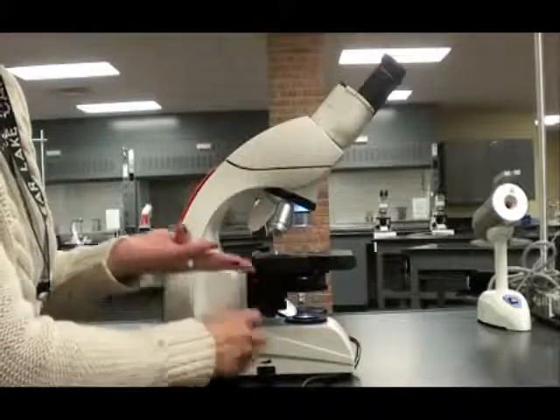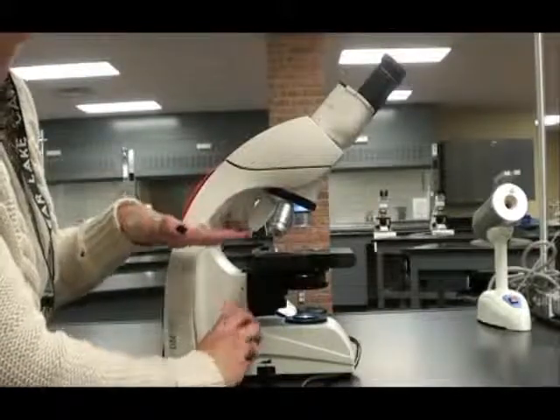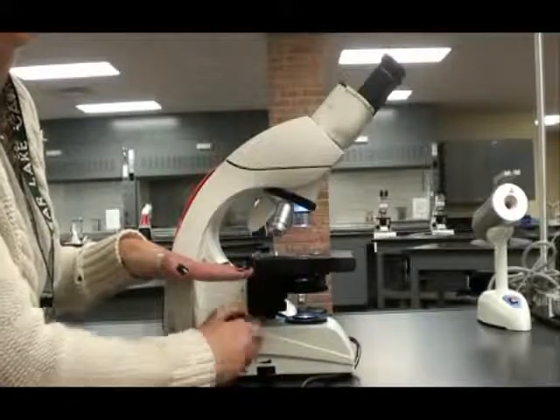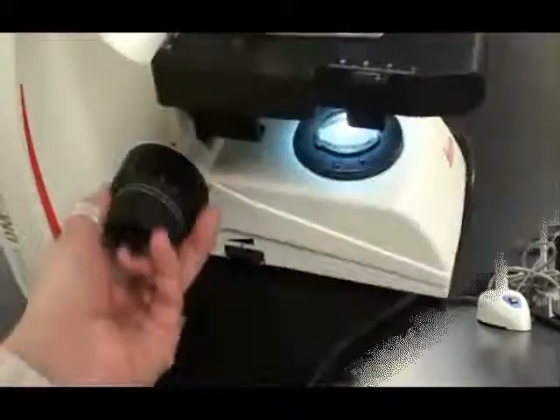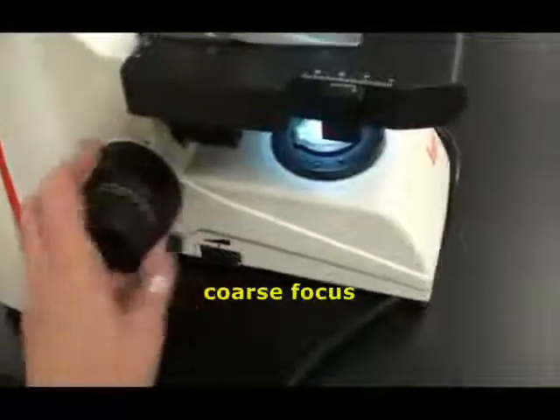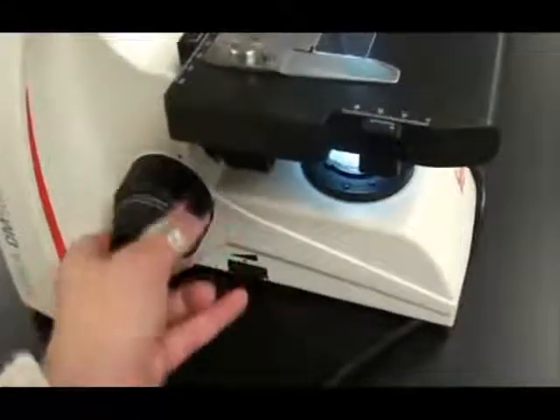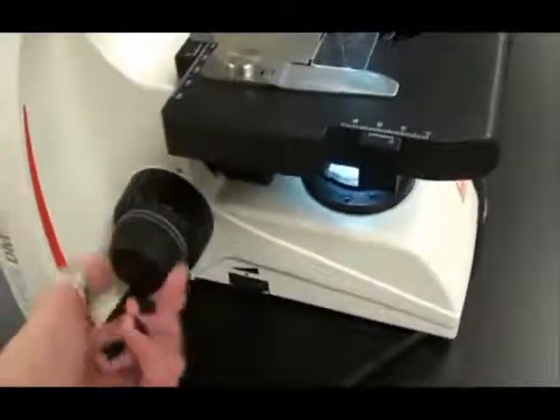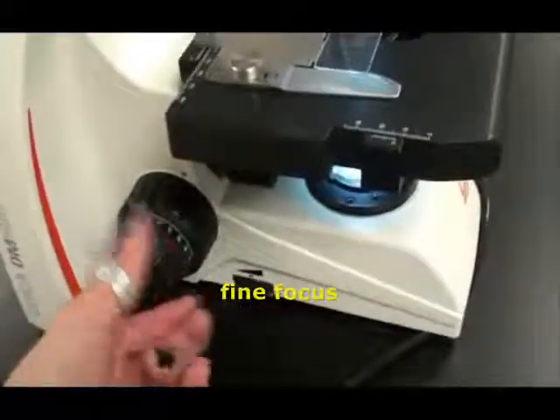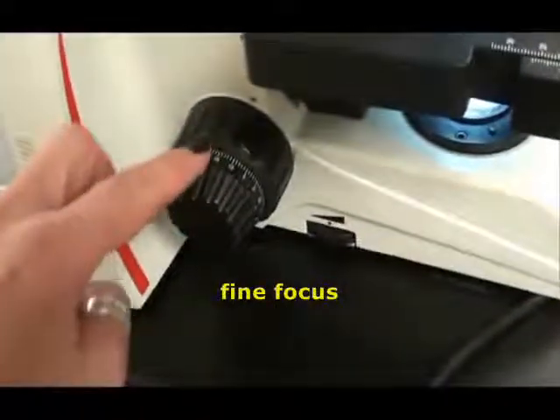The focus knobs raise and lower your stage, and the vertical position of your specimen is what determines whether it's in focus or not. The coarse focus can be adjusted by turning the part of the knob that's closest to the body of the scope. The fine focus can be adjusted by manipulating the outer portion of this knob, doing so fine-tunes the image of your specimen.